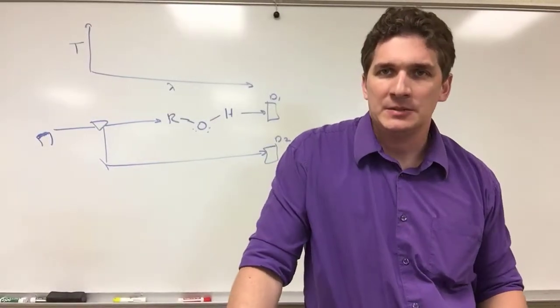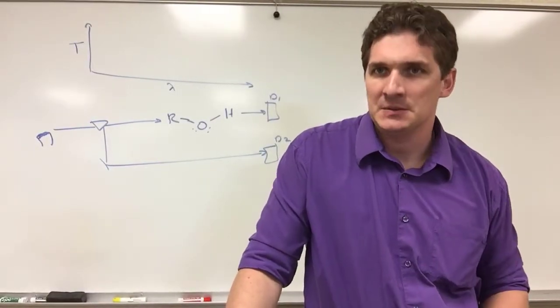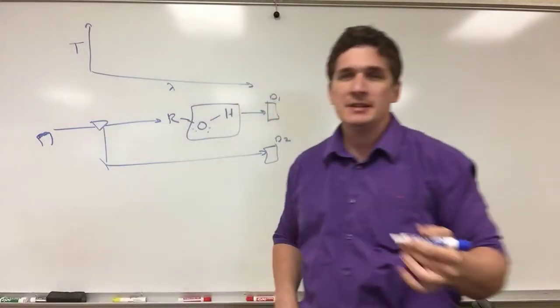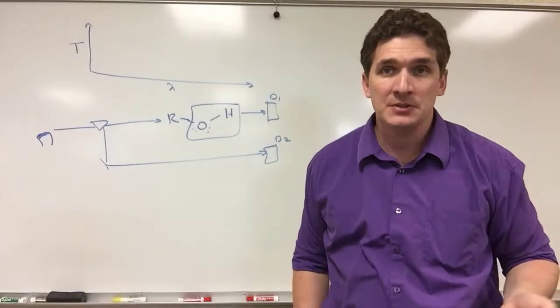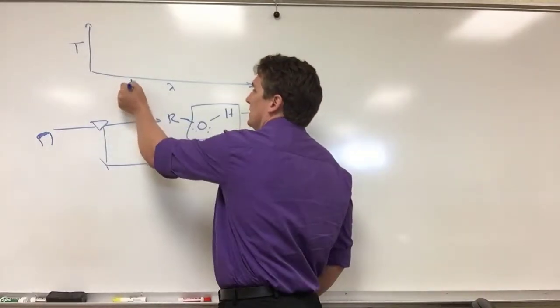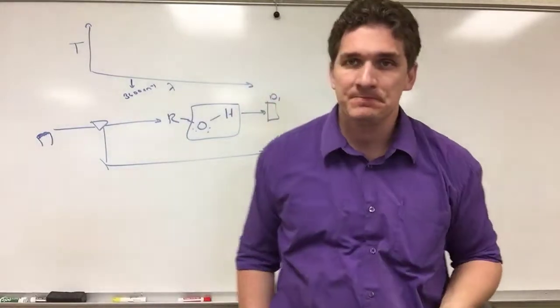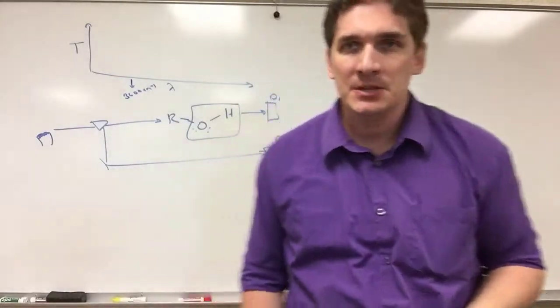So in terms of a practical discussion about how infrared spectroscopy works, let's focus on a hydroxide group. With something like silicon dioxide, there are OH groups present on the surface, and these typically absorb at a wavelength of about 3600 wave numbers, inverse centimeters. So what happens when we take this measurement?